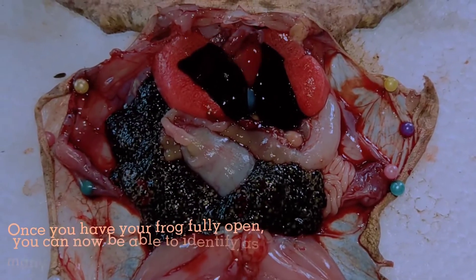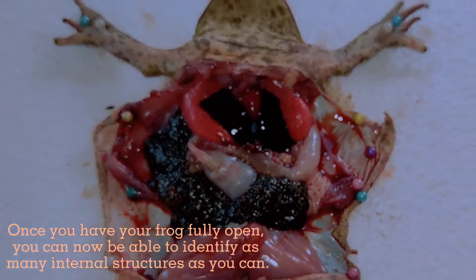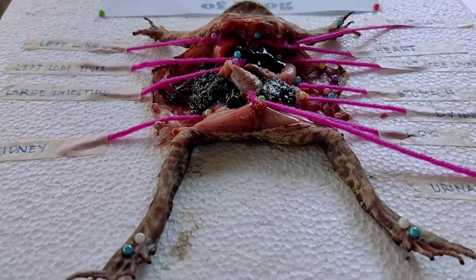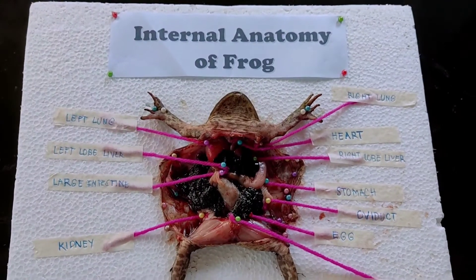Once you have the frog fully opened, you can now be able to identify as many internal structures as you can. So these are the internal organs of the frog that we have identified.